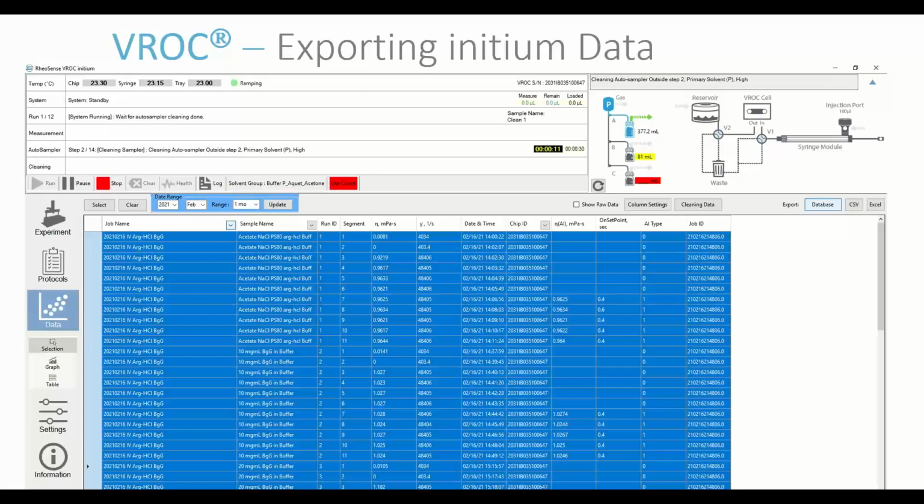So right here is the window for the Initium software. Clariti was first developed for analyzing Initium data, so this will focus primarily on the Initium. However, you can use Clariti on the m-VROC. You can import the m-VROC Excel export into Clariti and then analyze your data that way if you have an m-VROC on hand.